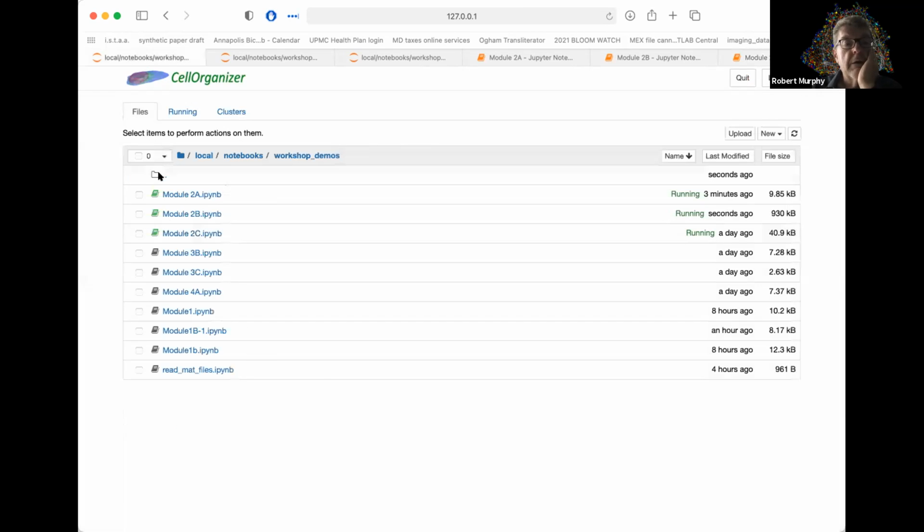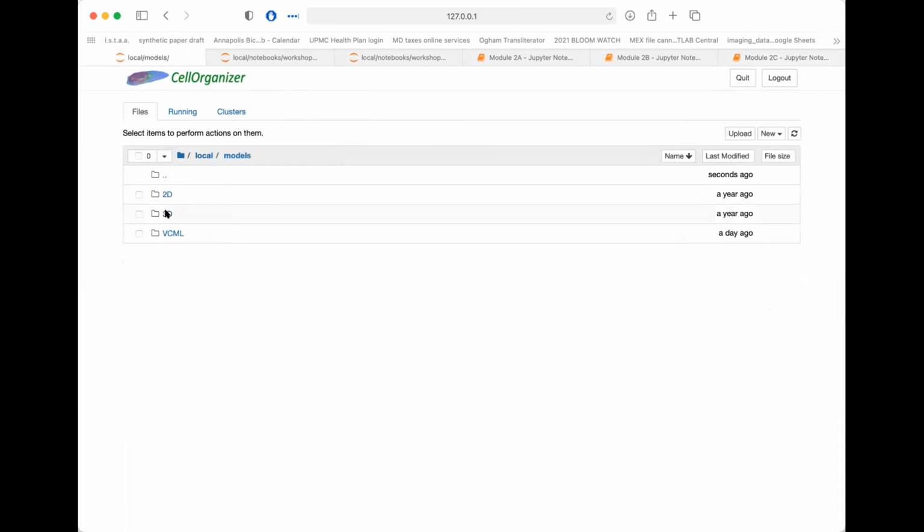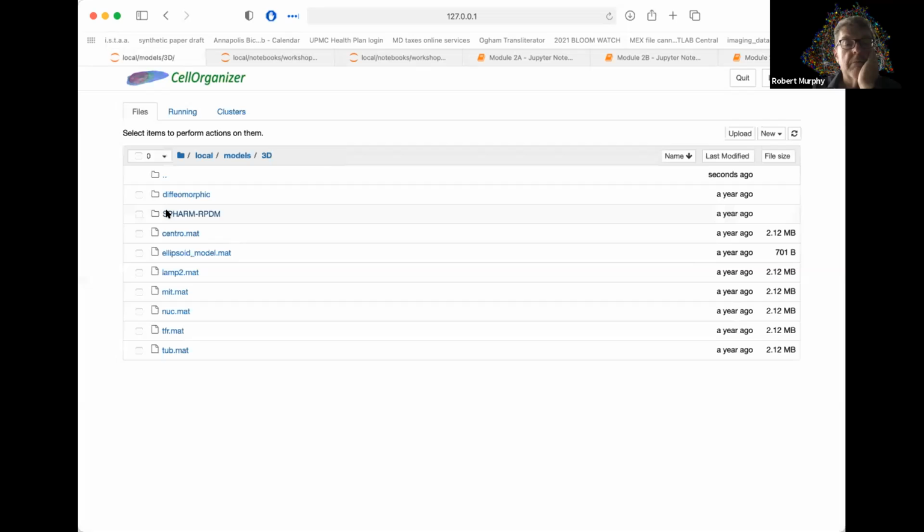And so we can show those by coming back here and going to, I have the container built. Do you want me to start sharing? Oh, again? No, we don't need to rebuild it. It was running just fine. When I ran it, it ran just fine.